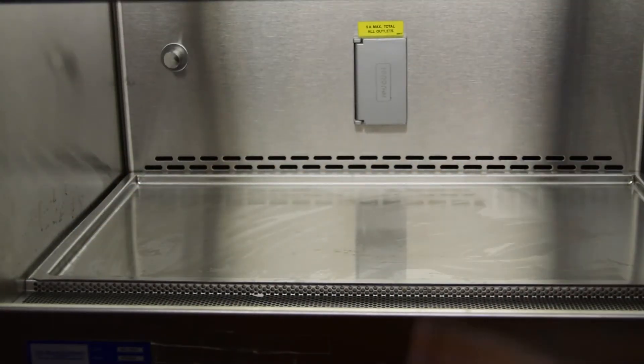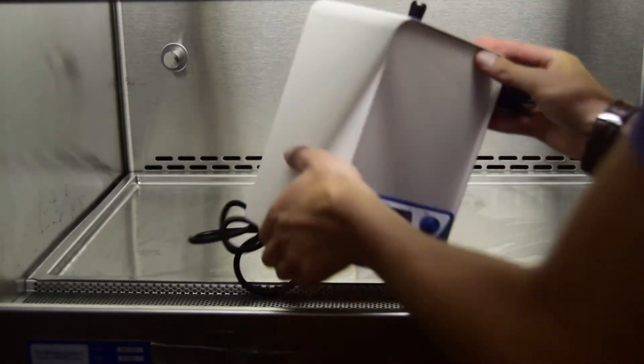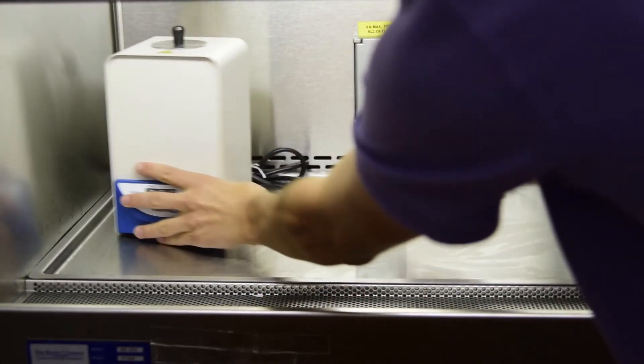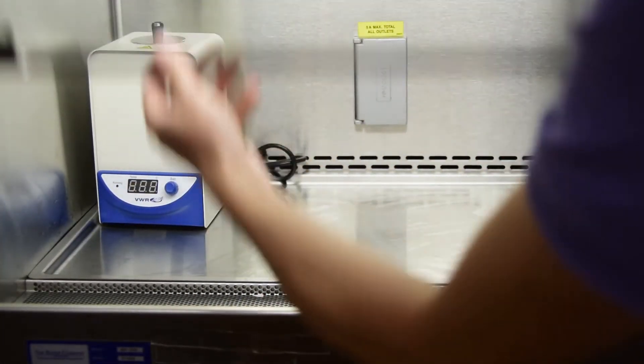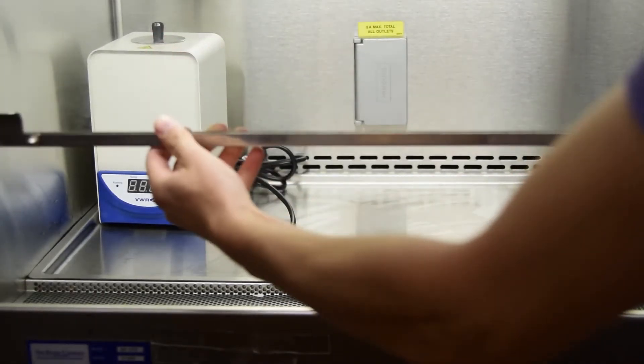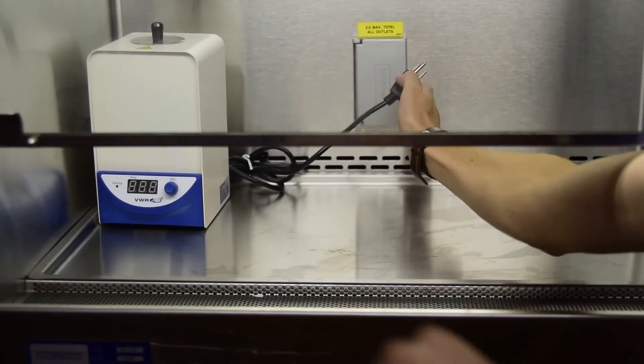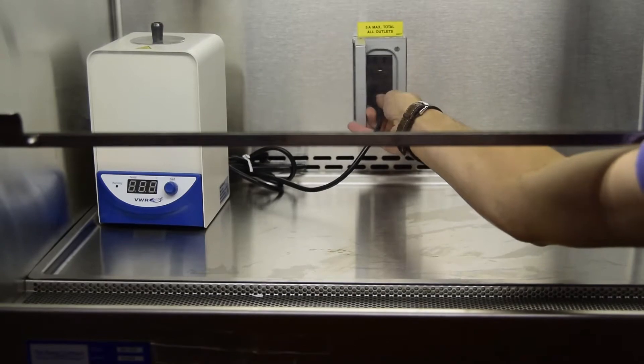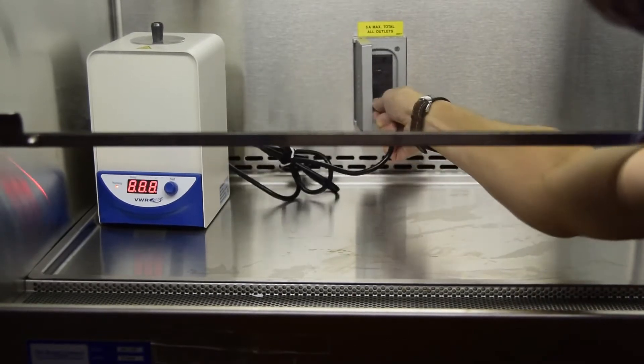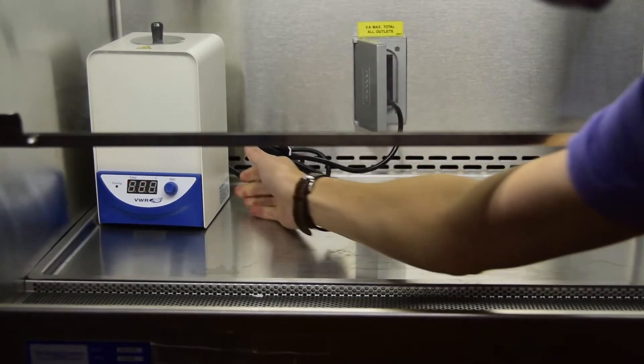Place the bead sterilizer inside, opening the sash a bit higher to fit it through. Keep the sterilizer upright to avoid spilling glass beads. Plug it in and turn on the switch in the back.